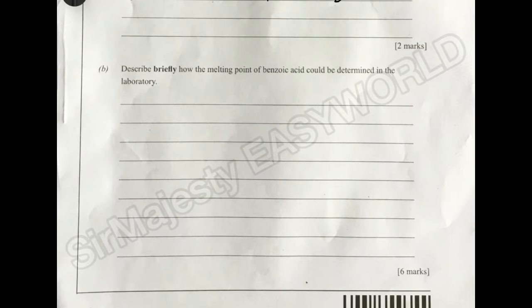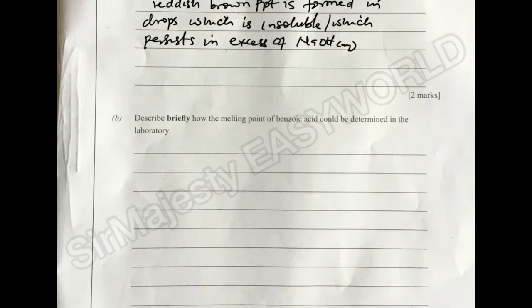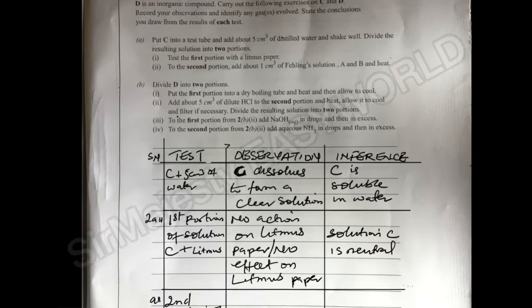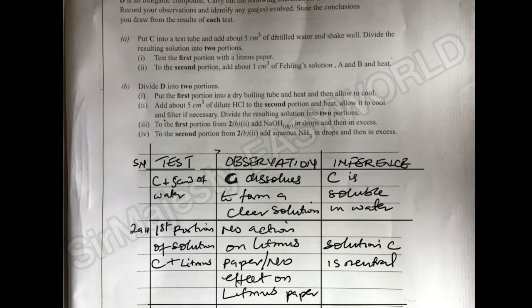Okay, so the little comment I have concerning this is about this particular salt analysis, the analysis of the zinc oxide, where students were asked to add HCl. See the point I'm trying to raise here. This particular place, to add 5 cm cube of HCl here.